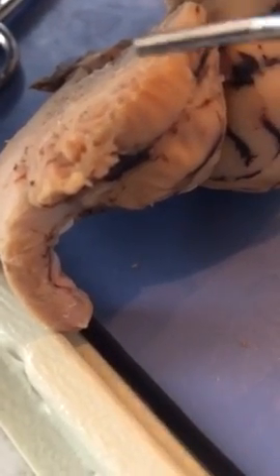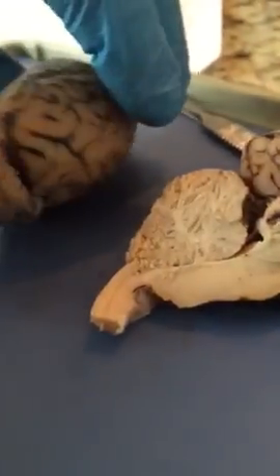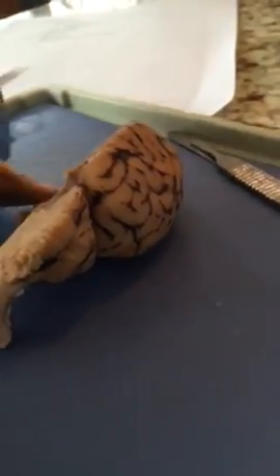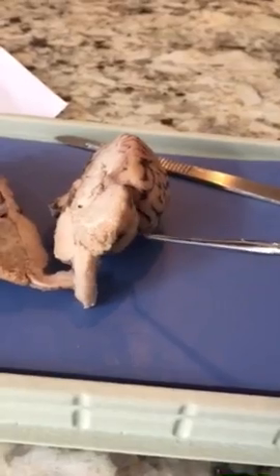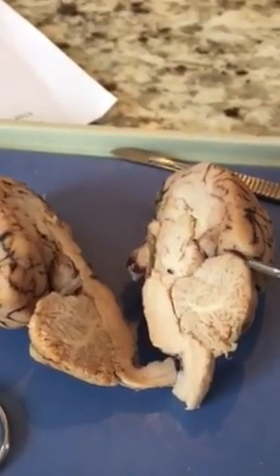Now I wasn't sure if these were the lateral hemispheres or if we were looking for simply the hemispheres on either side of the cerebellum, with the right and left. There's something I was a little bit confused about. I probably overthought it a little bit too much.